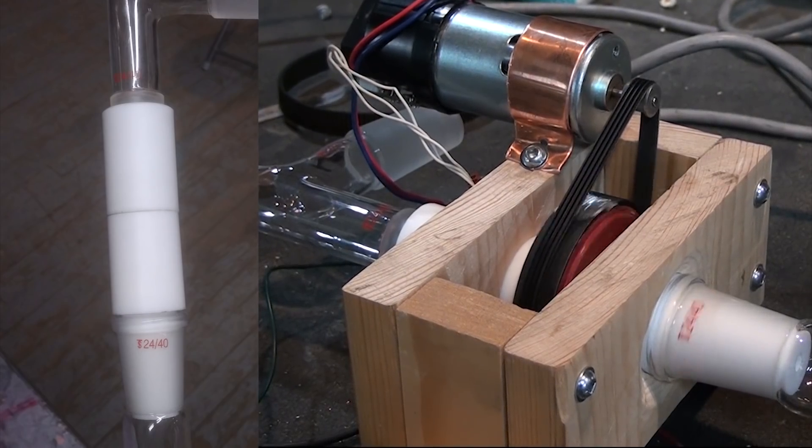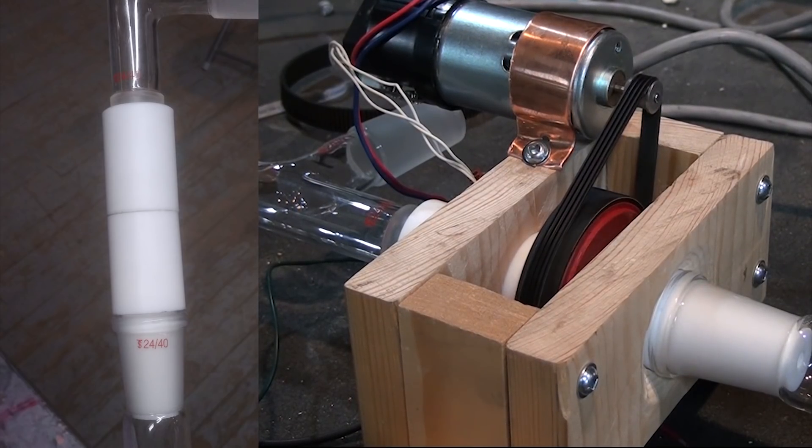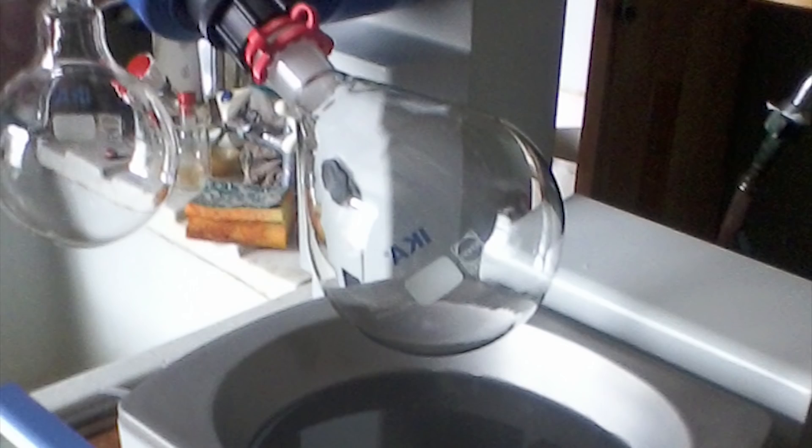The main design challenge is to build a coupling where the top won't rotate so that it can connect to the main distillation apparatus, while the bottom can move freely so the flask that's attached can be rotated slowly in a water bath, all while maintaining the internal system under vacuum.